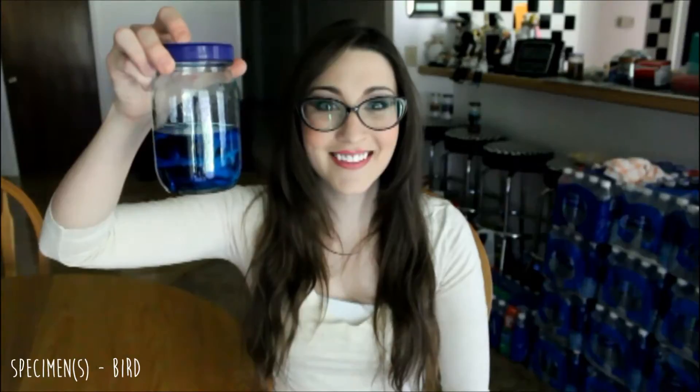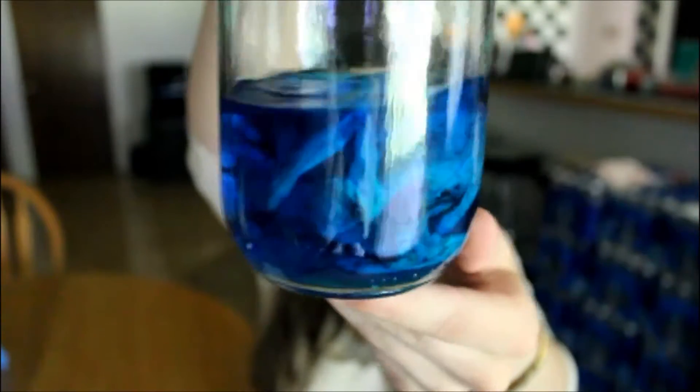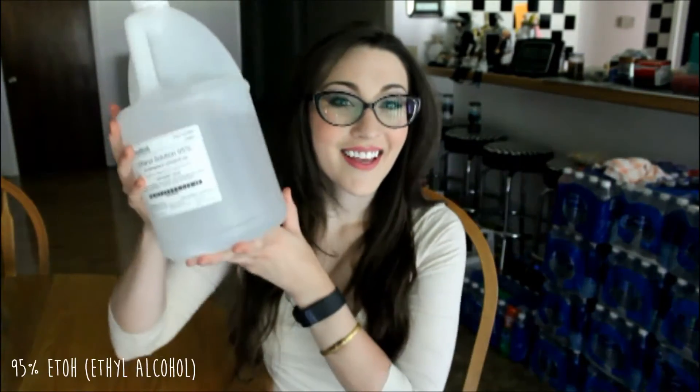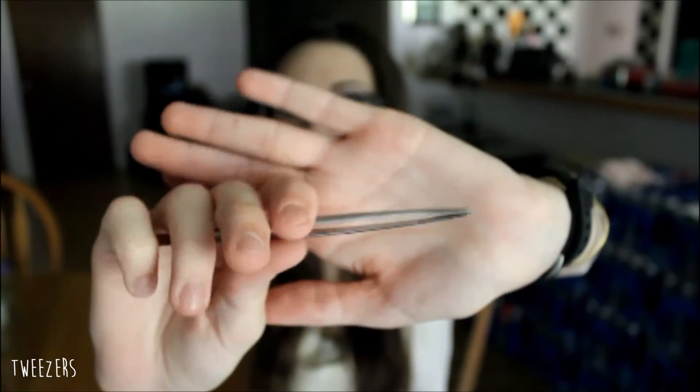So let's go over some of the things that we need. First, you're going to need your specimens and your cartilage stain, four jars, your 95% ethanol, distilled water, your tweezers, lab goggles, lab gloves, and your 100 milliliter graduated cylinder.